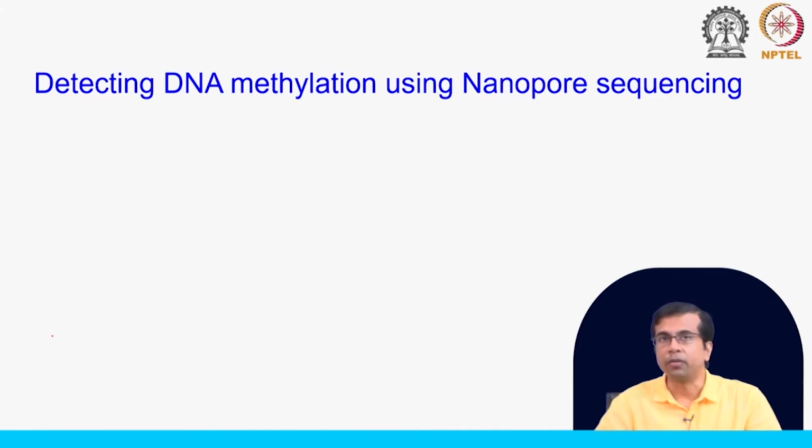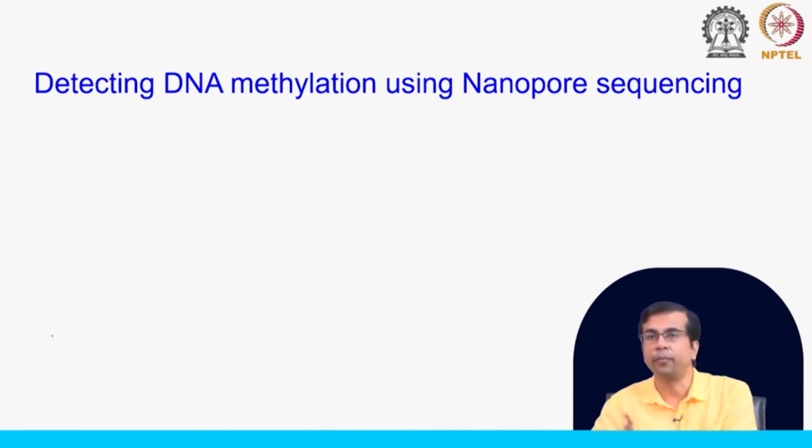Now, let us move on to nanopore sequencing, and how you can apply it for detecting DNA methylation. If you remember, in nanopore you have these channels through which the DNA molecule passes and it changes the current. There is a current at the picoampere level going through the nanopore, and the moment DNA enters, it changes the resistance, and that alters the current. This change in current signal is detected by the detector, and then the base call happens.